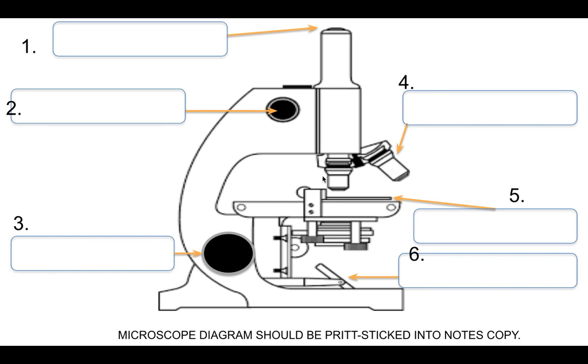Now these three lenses here are called objective lenses, and objective lenses give even greater magnification. On a microscope, and we'll bring one into class the next day, we will see that there are times 4, times 10, and times 40 magnifications on many of these objective lenses.